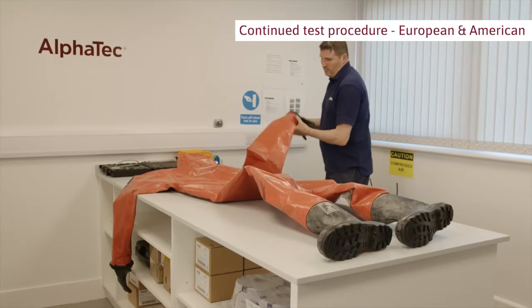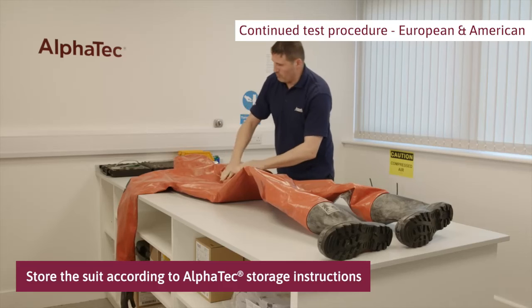Fold and pack the suit. Store it according to Alphatec storage instructions.